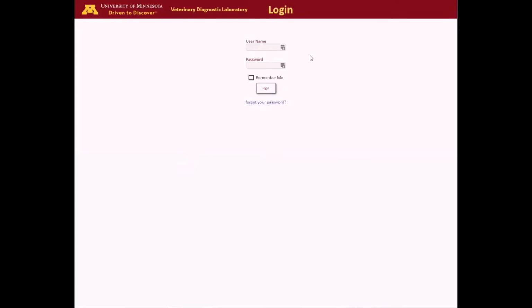This demonstration video will walk through the basic functions of the University of Minnesota Veterinary Diagnostic Laboratory Results Access website. Your landing page on the login has areas where you can enter your credentials, username and password, that you'll be using for your session.